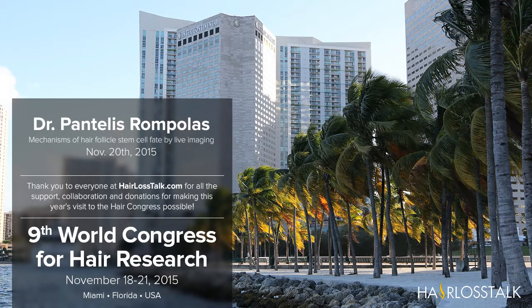We collected a lot of these movies at different stages during the hair regeneration process. In this example, you see 2 hair follicles at early anagen phase, and we can see cells dividing. We quantified all these activities, and this is a summary of the data, and we started to see patterns emerging. You can see that the majority of the cell divisions that we capture occur primarily in the lower part of the hair follicle, in close proximity with the dermal papilla, and also that these cell divisions have a certain orientation. We capture a number of other cell behaviors which bring up interesting cell biological questions, but the summary is that cell activity seems to be spatially regulated within the niche.